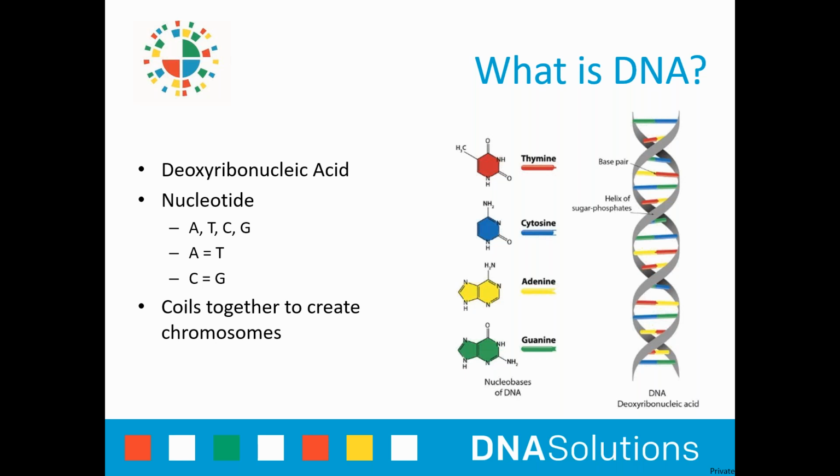The first thing we're looking to do in the lab is we're trying to get that DNA out. We can obtain good amounts of DNA from all kinds of cells. You'll obviously be aware that we often collect cheek cells, which are called buccal cells. We can use skin cells. We use blood sometimes. Only the white cells in your blood contain DNA. We use hair roots. We can even use an item that somebody's touched. So every time you touch something, some of your skin cells fall off. And we can try, and sometimes we're successful in collecting those from a surface.